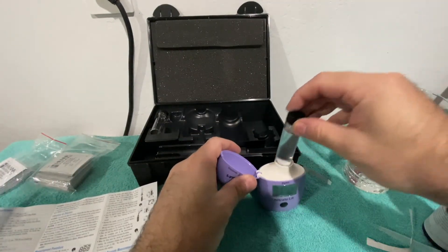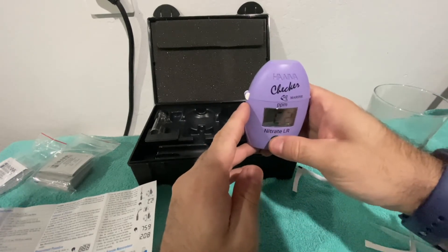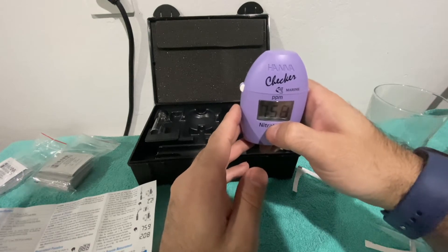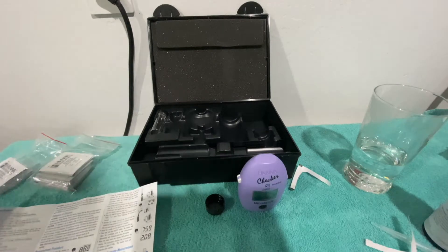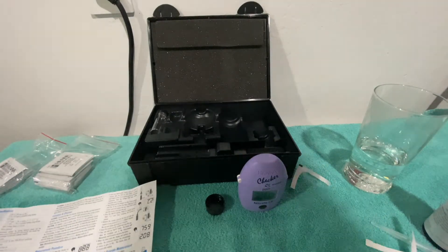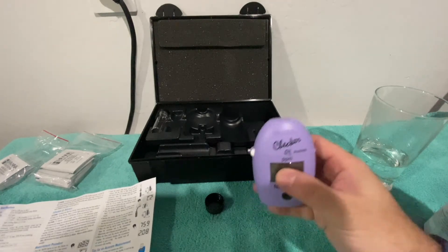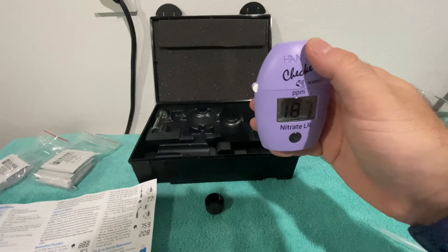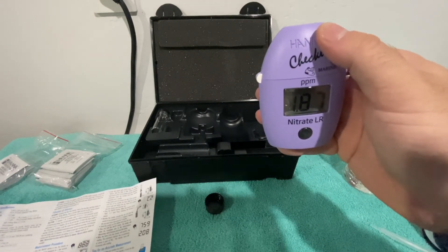After two minutes, put the cuvette back in, then press and hold. It is an eight-minute timer. After the eight minutes are up, give it a second or two and there is your nitrate level. My nitrate is 1.87 ppm.